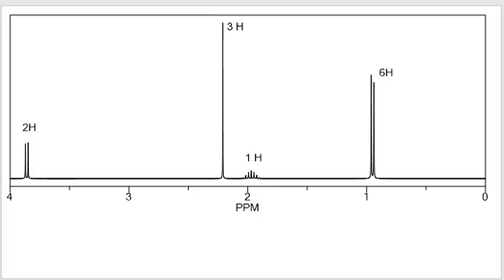All right, so we have a molecule, and we don't know the structure of it. It has the molecular formula C6H12O2, and you can see all 12 of the protons on our proton NMR: 6, 7, 10, and then 12. And there are 4 different types of protons.